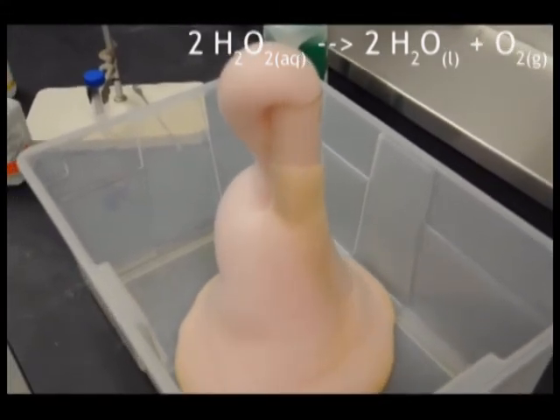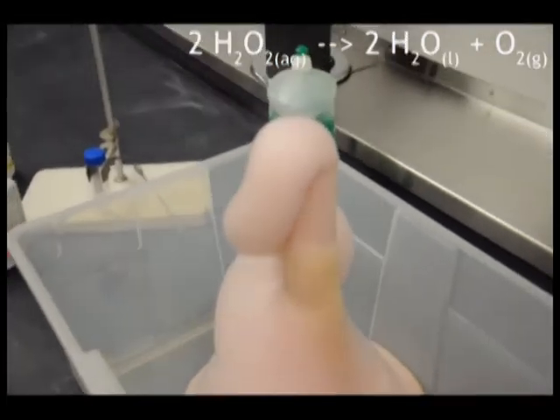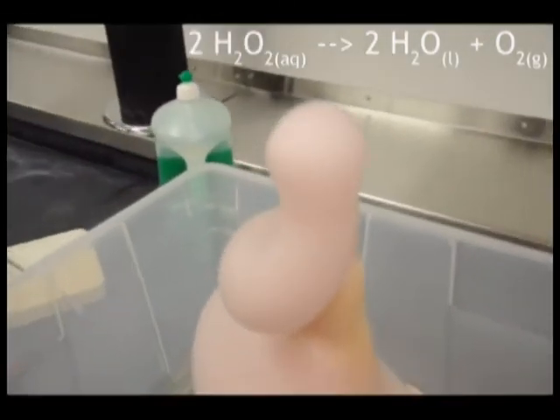At room temperature, hydrogen peroxide decomposes very slowly. Too slowly for any useful reaction.